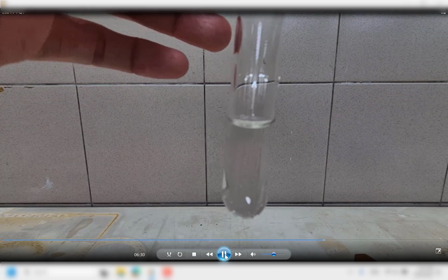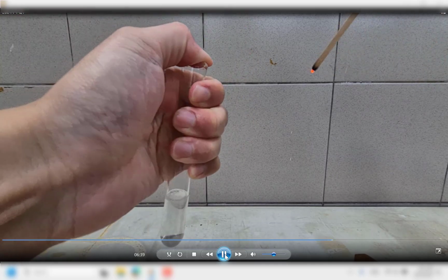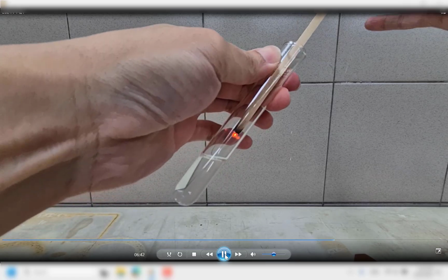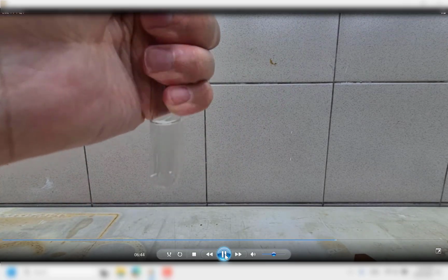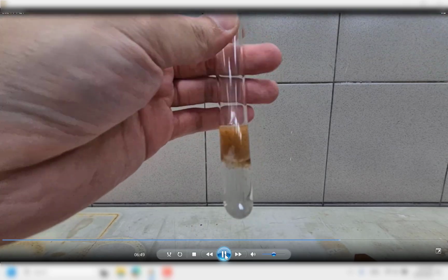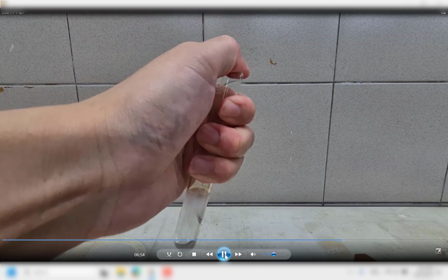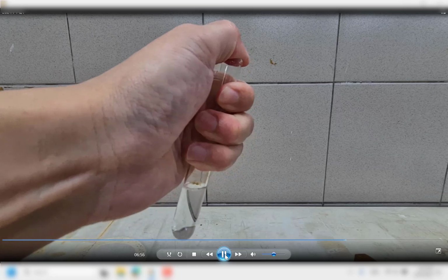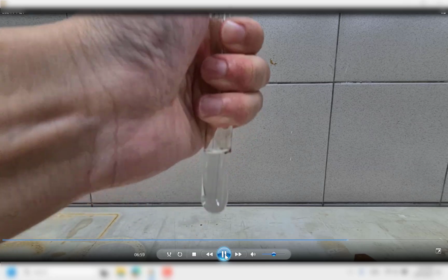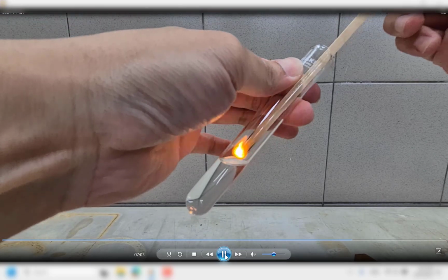Then we just gather, and then we insert. We try to keep most of the gases intact, and then you check. Not very clear, but it does light up a bit more. So I'm going to add in more of the sodium hydroxide for more oxygen to be released. Concentrate them. We test it again. Now it's obvious.